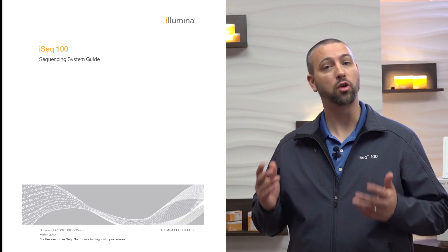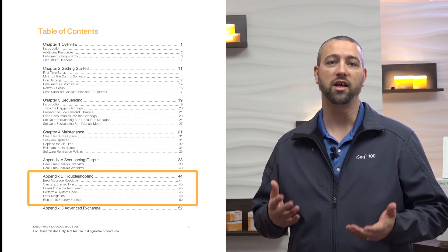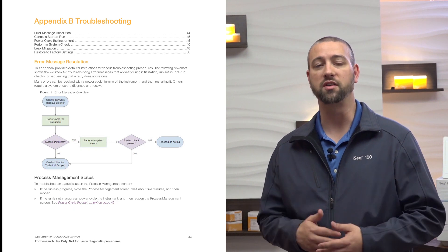Also, be sure to reference the troubleshooting appendix section of the iSeq 100 system guide, which has more mitigations and guidance including error message resolution, power cycling and system checks, and restoring to factory settings.